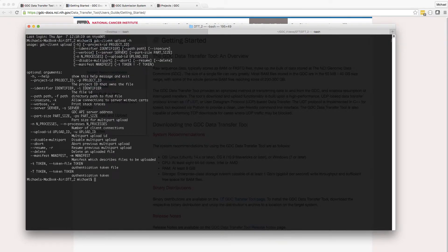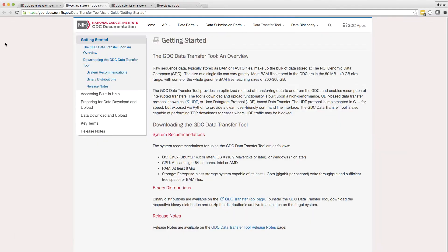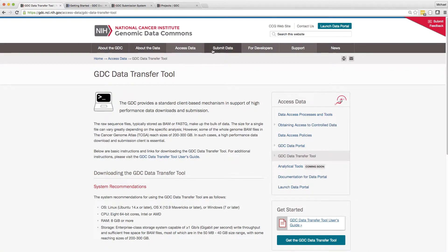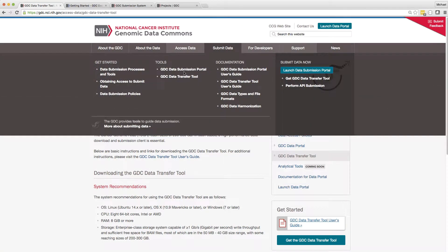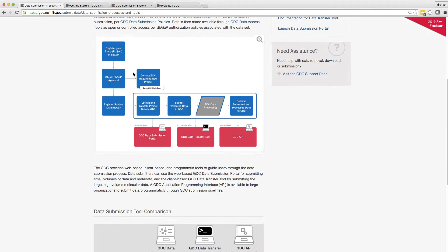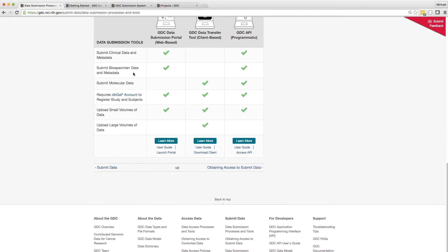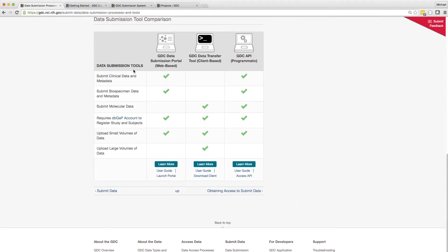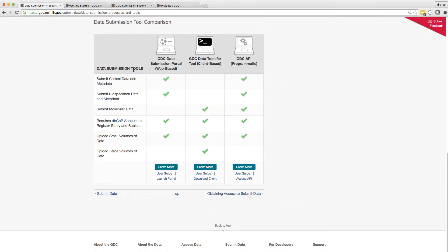While the GDC submission portal can be used to upload all metadata entries, such as clinical and biospecimen information, the Data Transfer Tool or the API are necessary for transferring large files like FastQ or BAM files to the GDC.